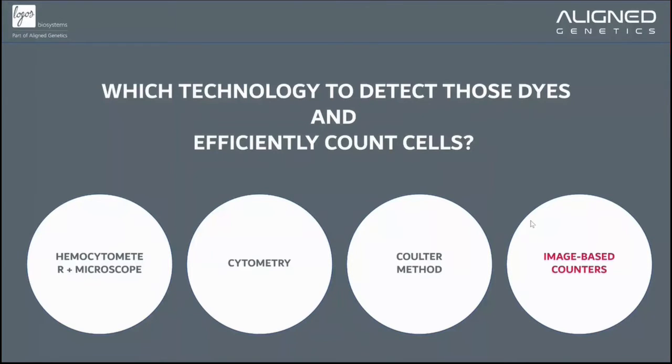In the market, the image-based counters are the most common and affordable solution to count cells with those viability dyes. If we say image-based counters, it's because it takes images. It takes a picture or multiple pictures.